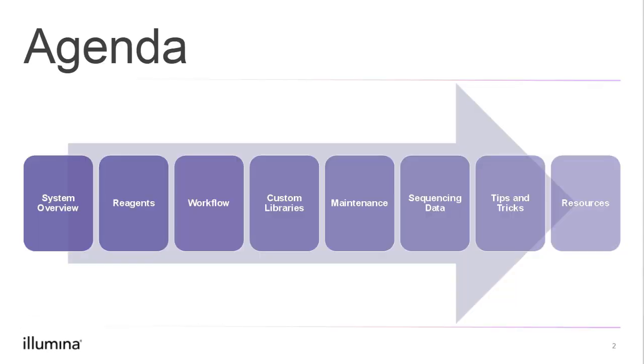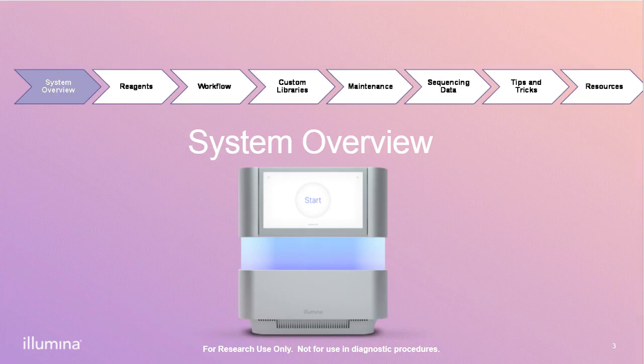Our agenda today is we're going to take some time to talk about the system overview. We'll discuss the reagents, the workflow, use of custom libraries on the instrument, maintenance, sequencing data, tips and tricks, and resources. Starting off with the system overview.